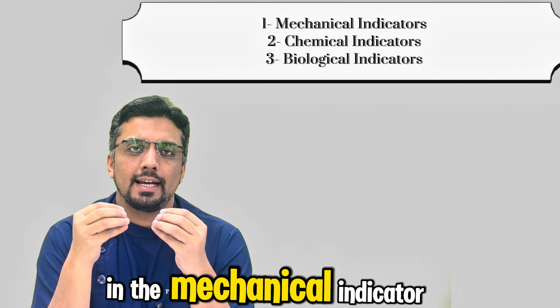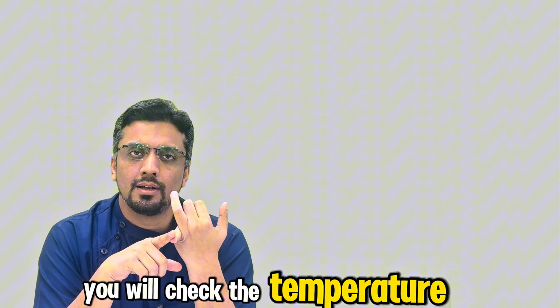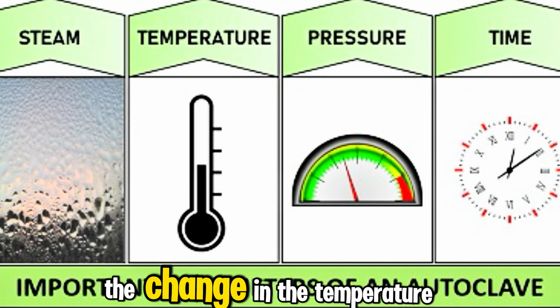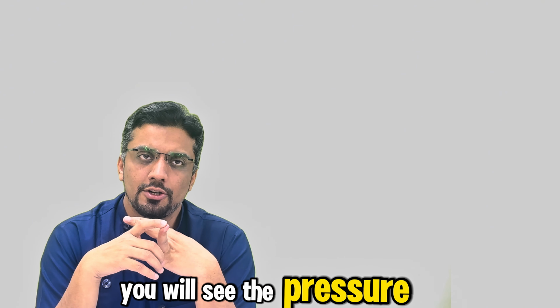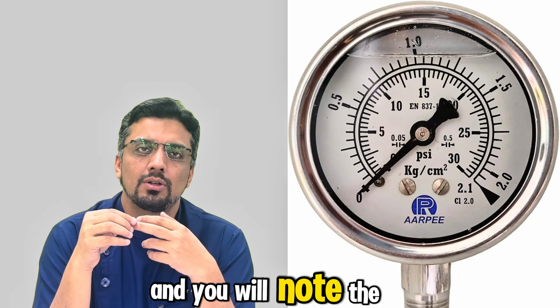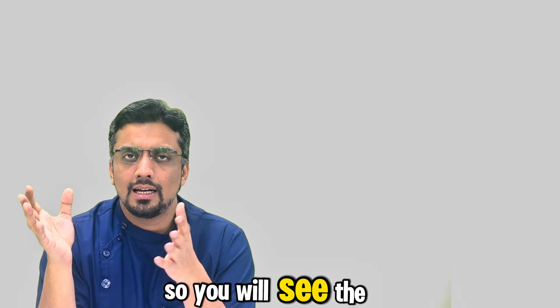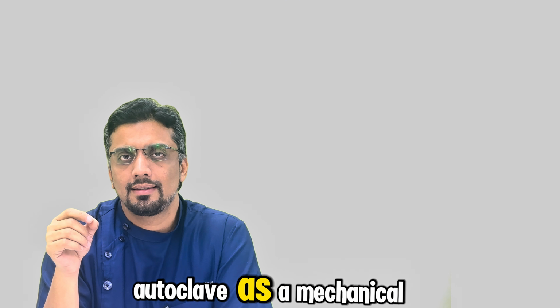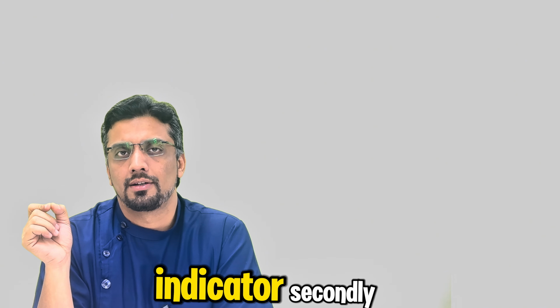In the mechanical indicator, you will check the temperature, which is shown on the autoclave, and you will note the change in the temperature. You will see the pressure from your pressure gauge, and you will note the time. So you will see the parameters that you record over the autoclave as a mechanical indicator.